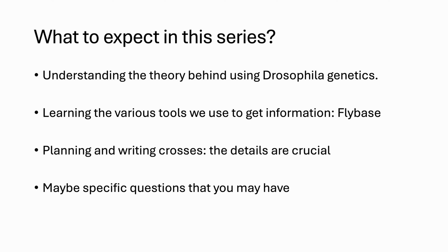You can understand how you can hyperactivate a gene, a protein's function. You can also, once you understand those basic principles, learn how to design these experiments yourself. How can you plan and write crosses, care for your flies?